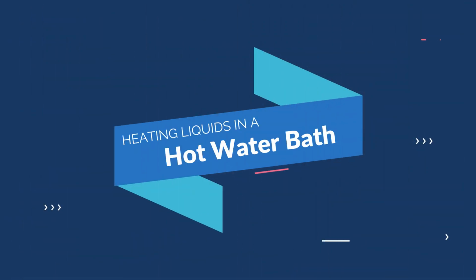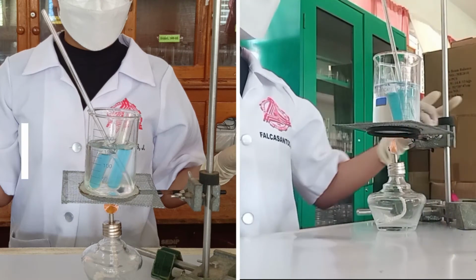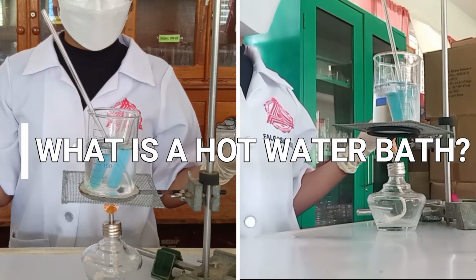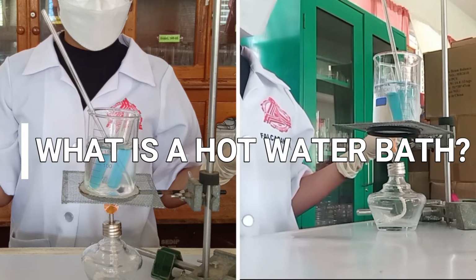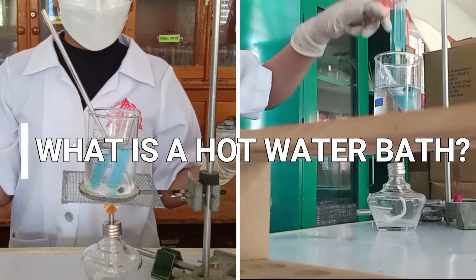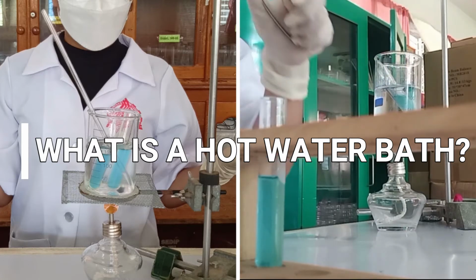Heating liquids in a hot water bath. A hot water bath is used when heating flammable chemicals that might combust if exposed to open flame. It is also used for a small quantity of solution that needs to be held at constant temperature over a period of time, and for equal distribution of heat to the sample.